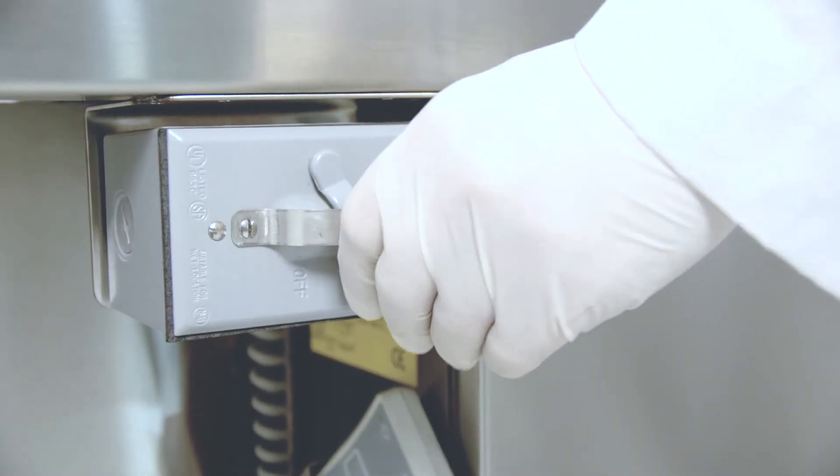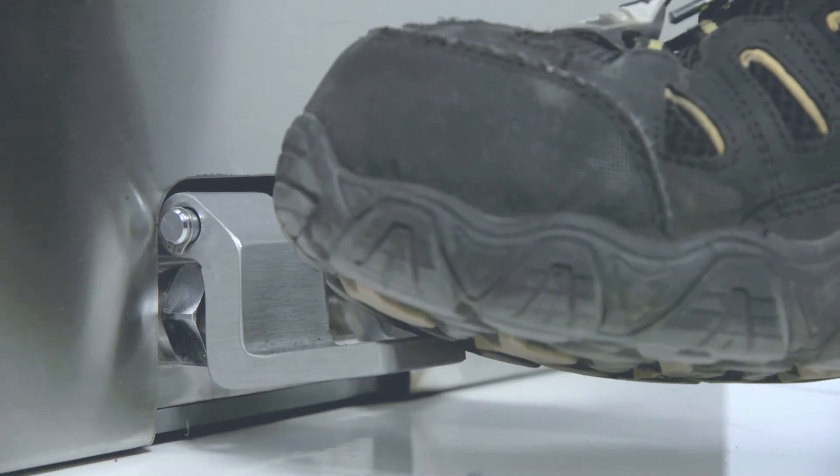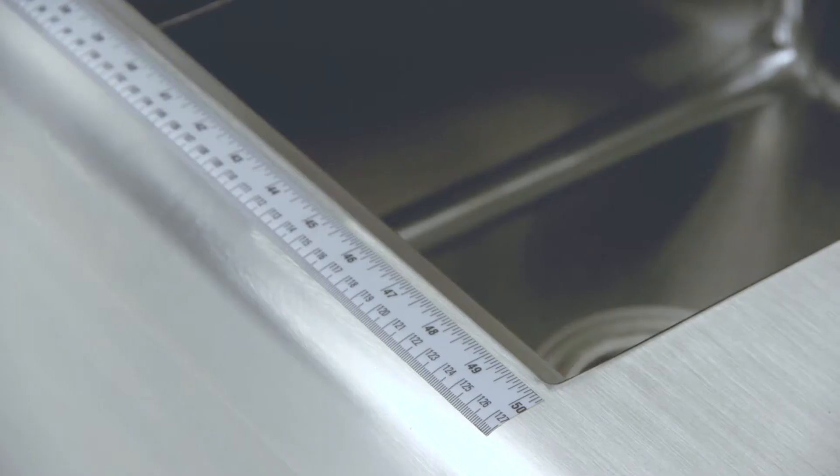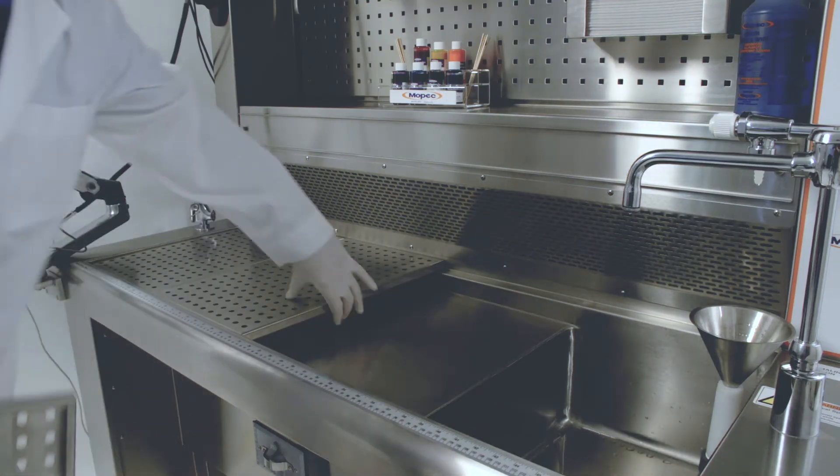The MB-800 incorporates key standard features including adjustable working heights, a rounded front edge, and interchangeable grid plates.